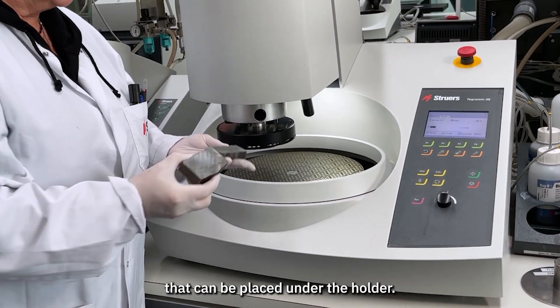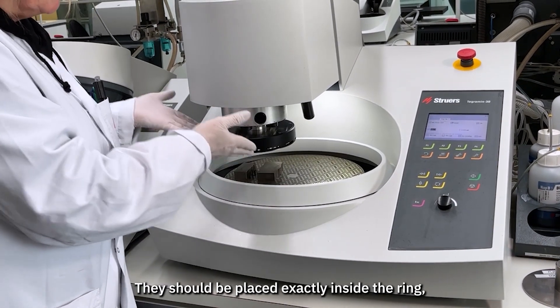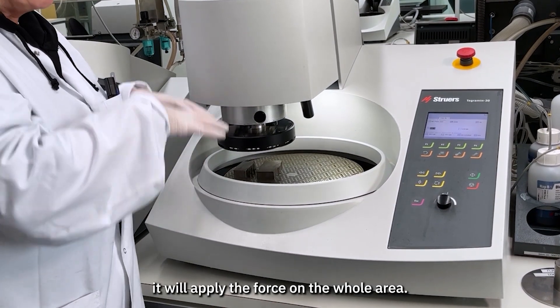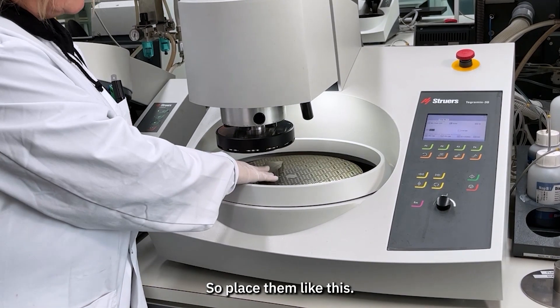Here are some weldings that can be placed under the holder. They should be placed exactly inside the ring so we are sure that the force is applied on the whole area. Place them like this.